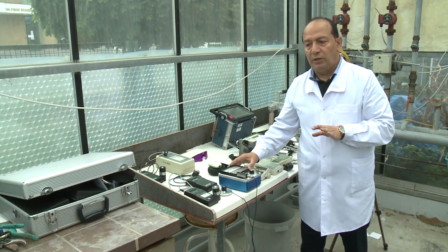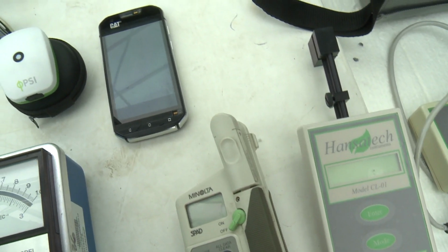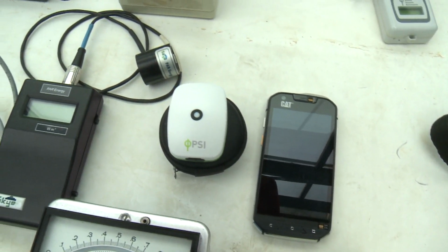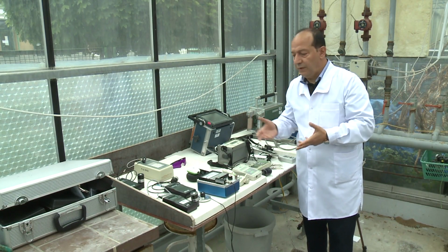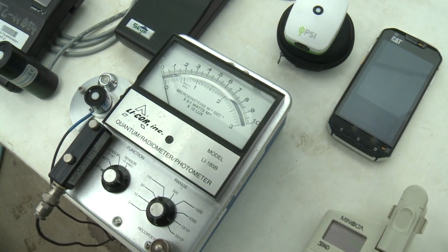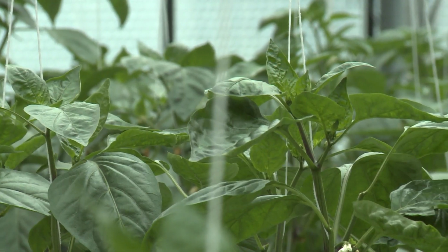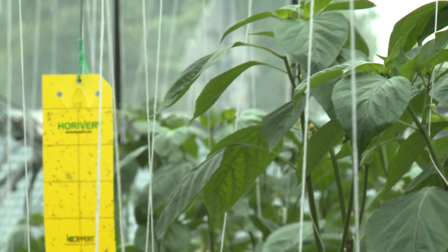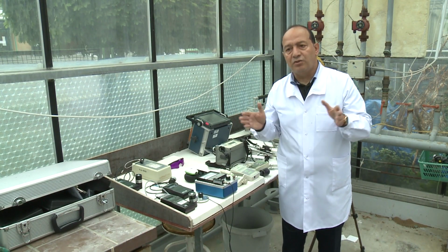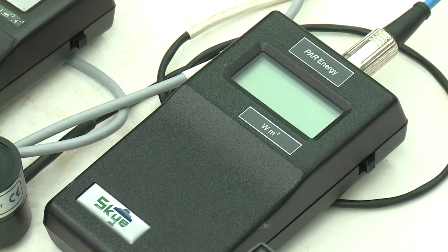As you know, usually we used to bring the plants inside the lab. Now we are free. We are coming with these sets of portable instruments, going out and traveling everywhere we would like to go. We go to the forest, we go to the lake, we go to the greenhouse or to the field. We can do our measurements in a very short time, because those measurements are sometimes done in 1 second and some others take a few minutes. So in a short time we can get a huge amount of information about our plants, and we can then combine all these parameters to get a better understanding of what is going on in our plants.